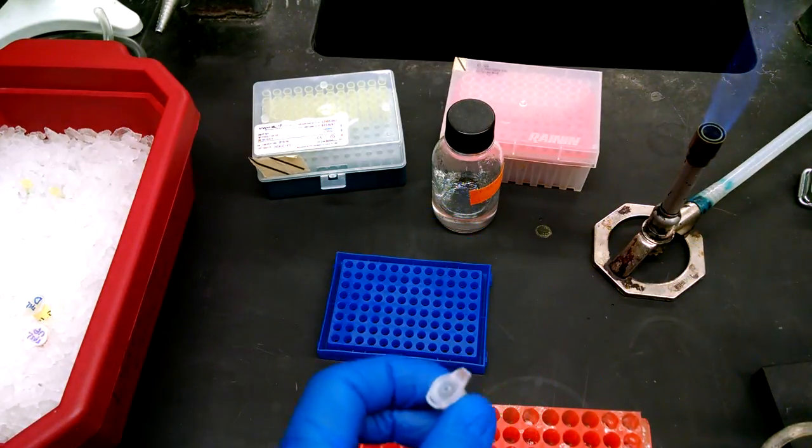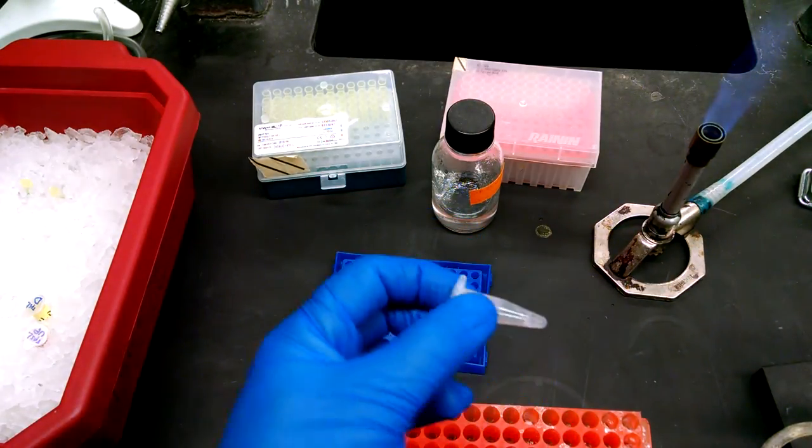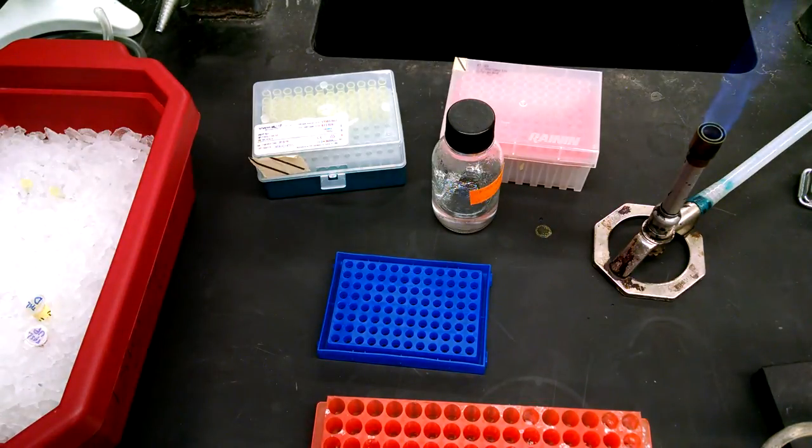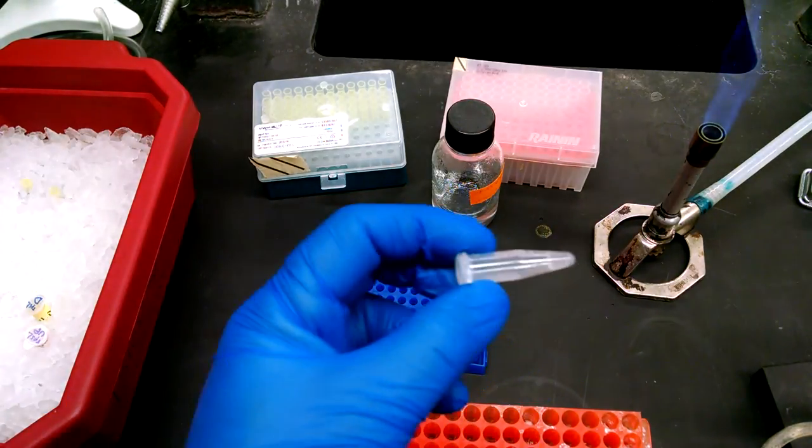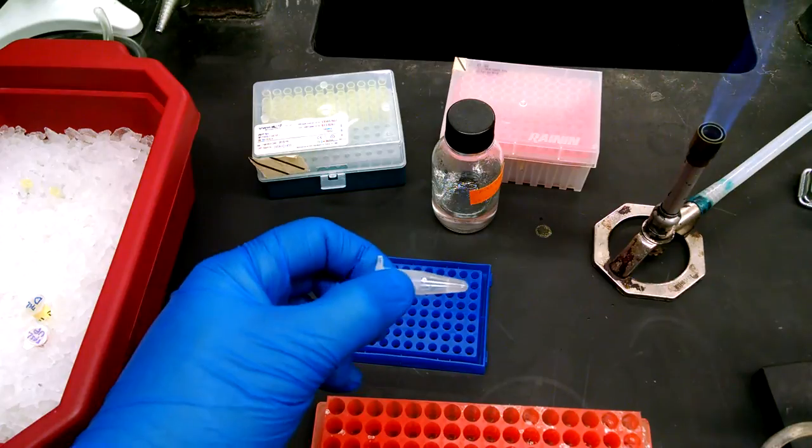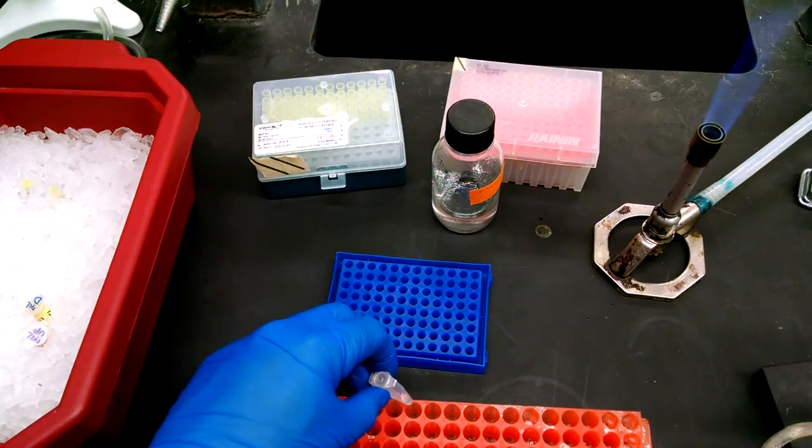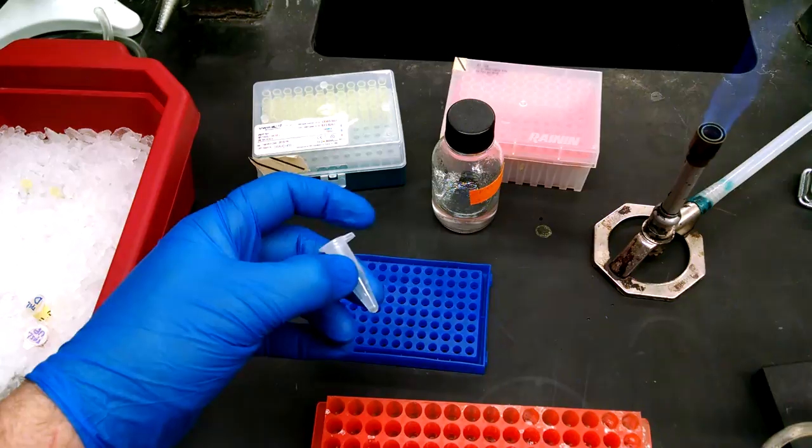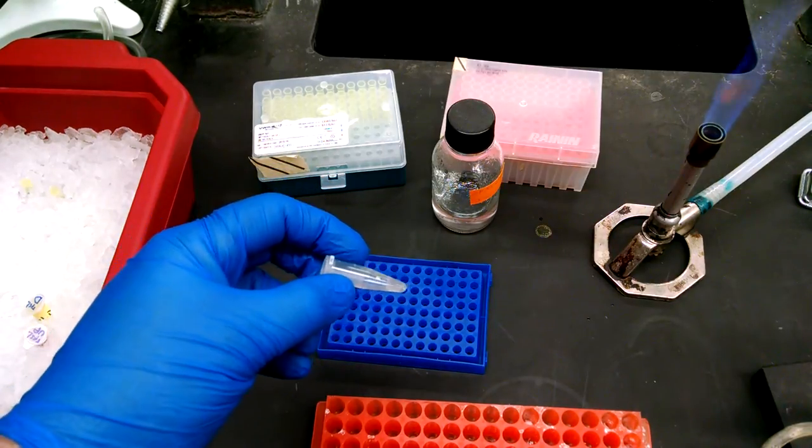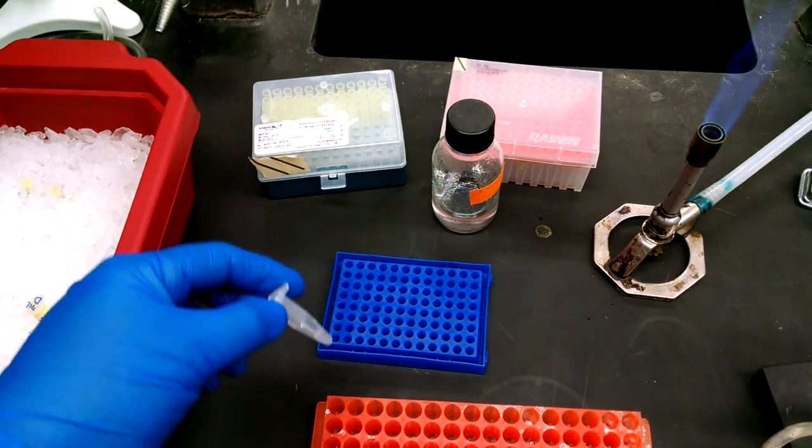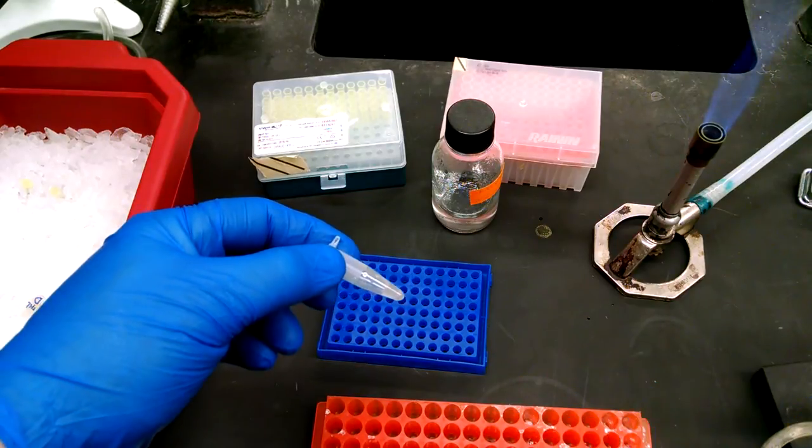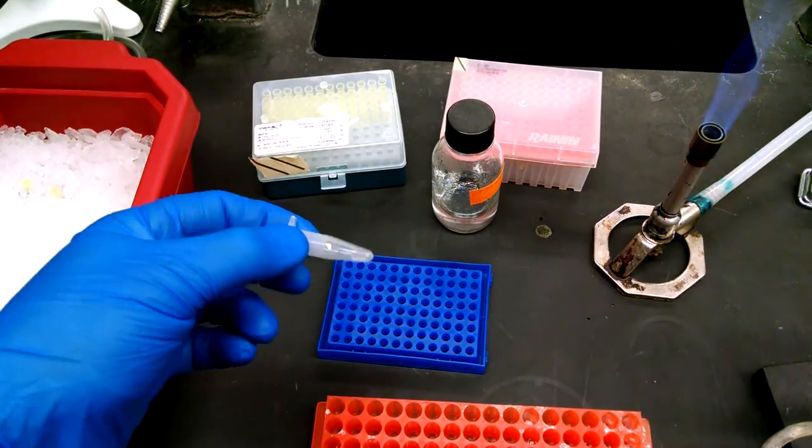And then you can do some vortexing of this as well. And so there's your template DNA, cells and water. And so remember, the first step of PCR is to heat up the sample up to almost boiling temperature. That's going to break open these cells and provide the DNA.